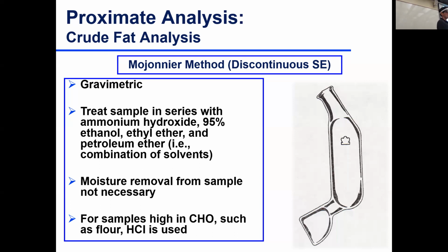So one of the questions of your lab report is going to ask you about reasons for underestimation. That could be one of the reasons if you mess up adding the ethanol or you added it late, then you might have clumps and the fat will be entrapped and will not be extracted by the organic solvents.